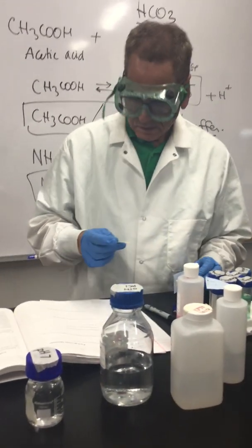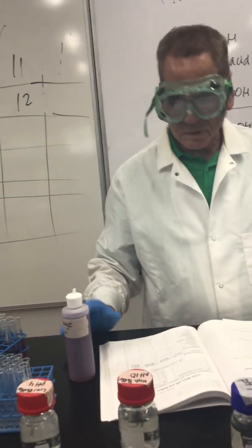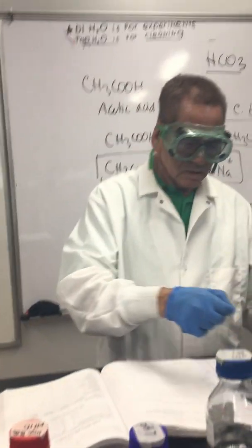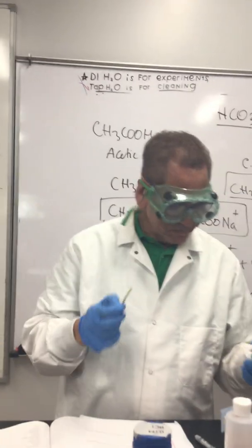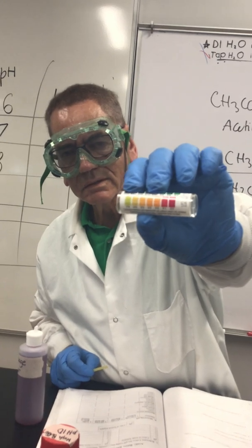Now, let me show you this also. We did this with the cabbage. I'm going to switch to the other system. We're going to use pH paper. The pH paper has a color here that gives you the color from acid to base. You see it there?